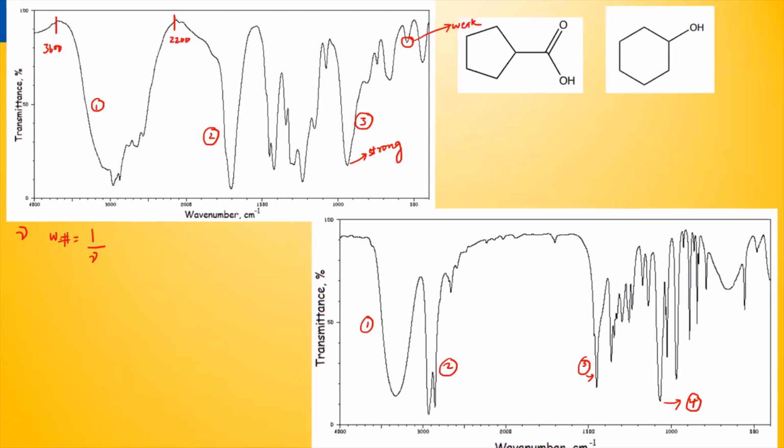There is only one thing on that table that will give you that, and that is OH stretching, which is the largest, but that table specifically tells you whether that OH came from an acid, an alcohol, or just water. You see clearly that the peak from 3600 almost to 2500 corresponds to the OH in an acid. Right away you know this is A and that's B.